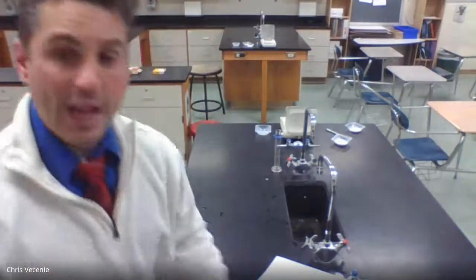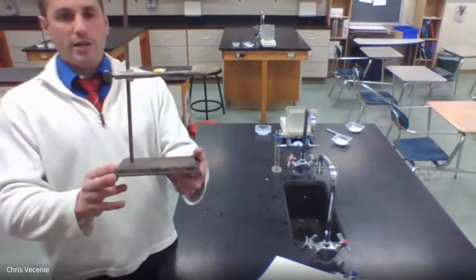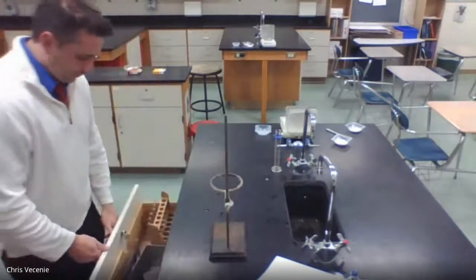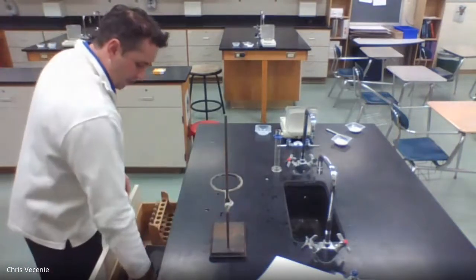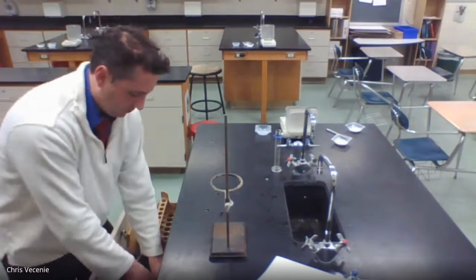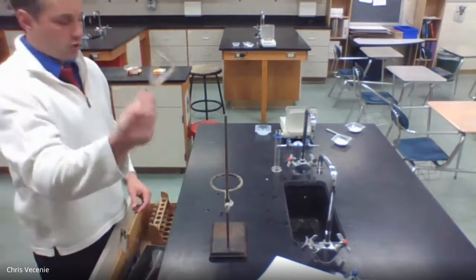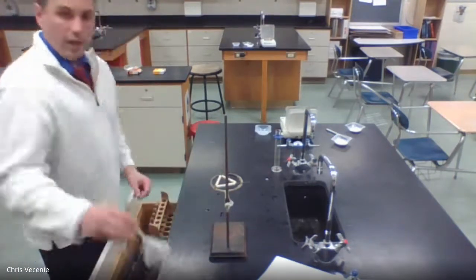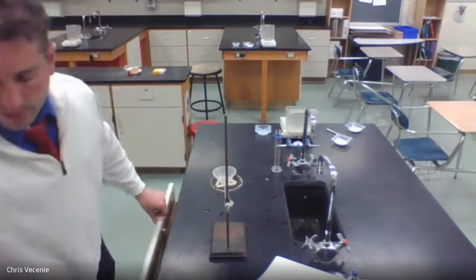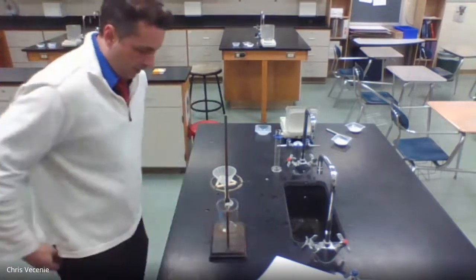All right, so like I said, to isolate it, we're going to set up a filtration system. So I'm taking my ring stand with my iron ring. I'm going to go into my drawer, and I'm going to get out my pipe stem triangle, which will hold my funnel, and my funnel. And all this is so that I can keep my hands free. And then I'll just take the 250 ml beaker that I had before, putting it under it.